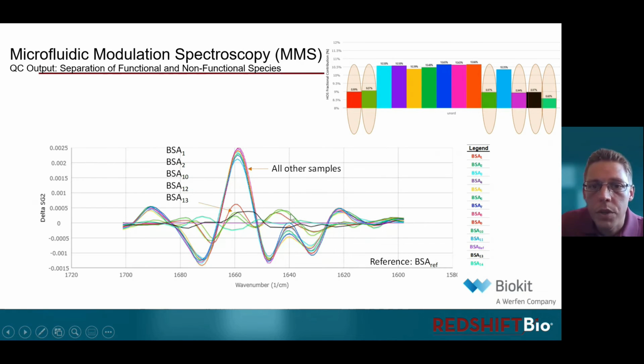There is some variation, which is why I think we see some variation in the other secondary structure outputs, and very clearly a second group which shows an increase, particularly in this disordered structure, but more importantly, is structurally different to the reference that is known to function correctly.